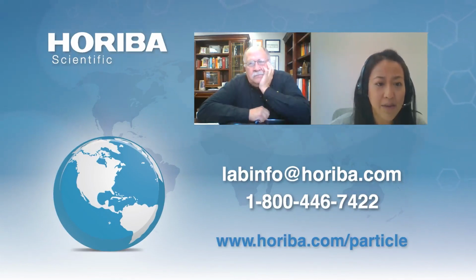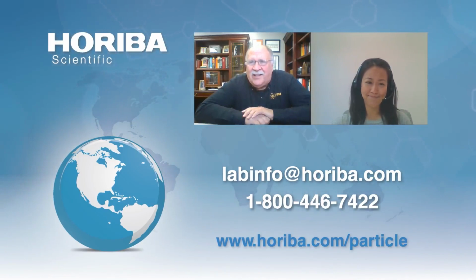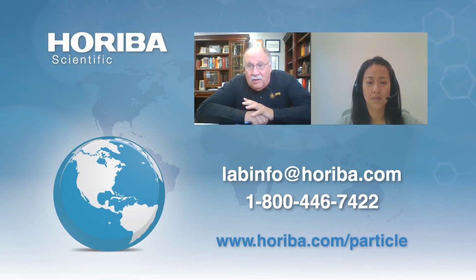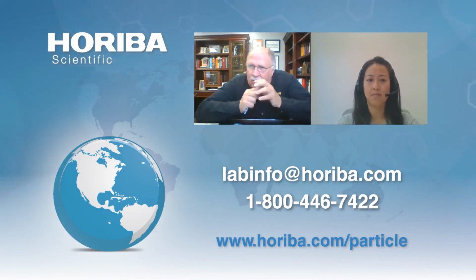Okay, so back to the question about the pharmaceutical industry. Can you comment more about tablet manufacturing in the pharmaceutical industry? Well, we should have a whole talk on tableting. What I think people in the pharma industry know very well is that getting the right tablet depends on whether you have a uniform mixture going into that tablet to start with, which is a whole other problem in particle technologies. How do you maintain uniform mixtures? The second thing in tableting is, do you have the right compression? Do you have the right flow aids? Do you have the right particle size that will actually compress nicely?